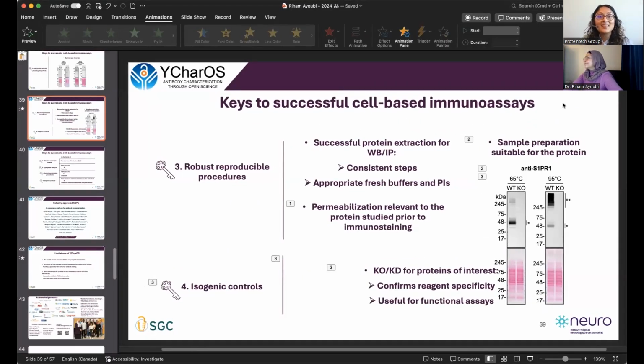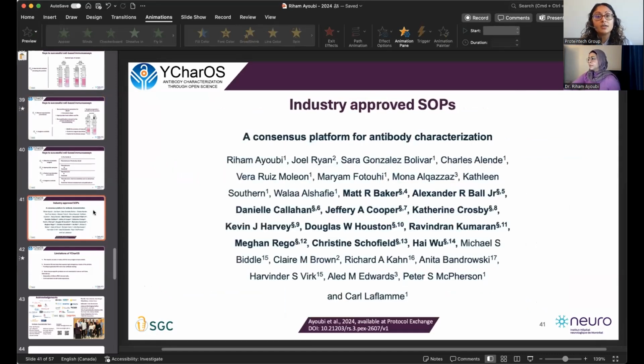Great. Thank you. The next question is, someone said that they attended Carl's talk at IRIC and looked at your papers, but just considering the Western blots themselves, do you think the unique protocol you use is suitable for everything? So including using only one type of membrane, one type of blocking, or one type of lysis buffer?